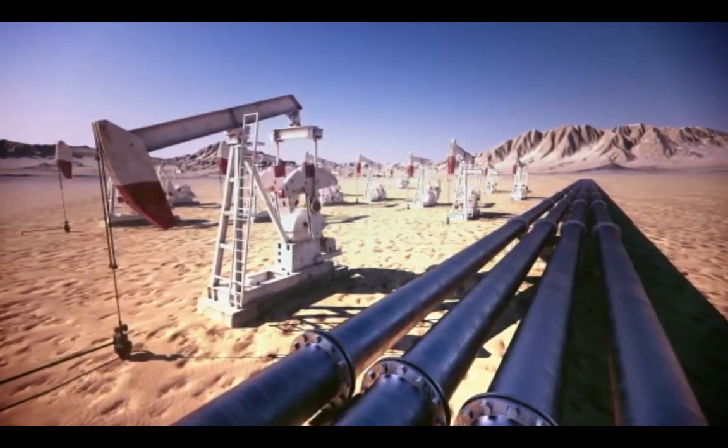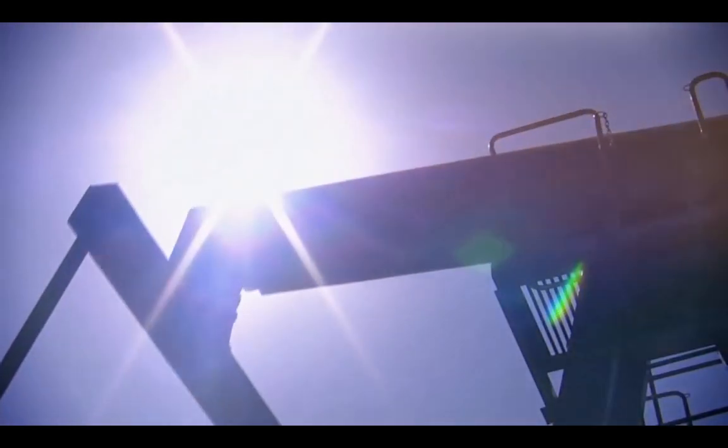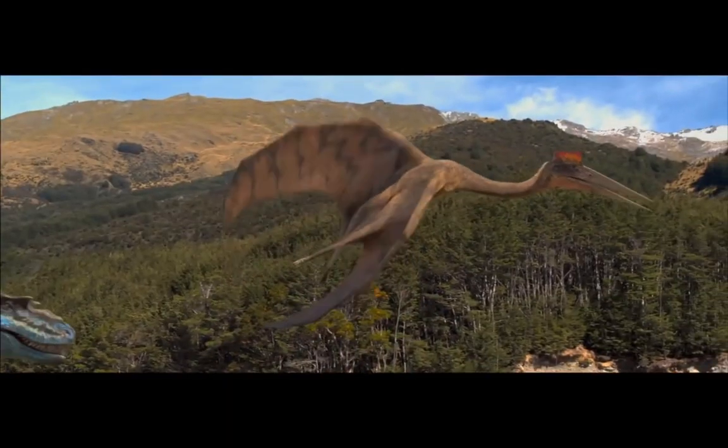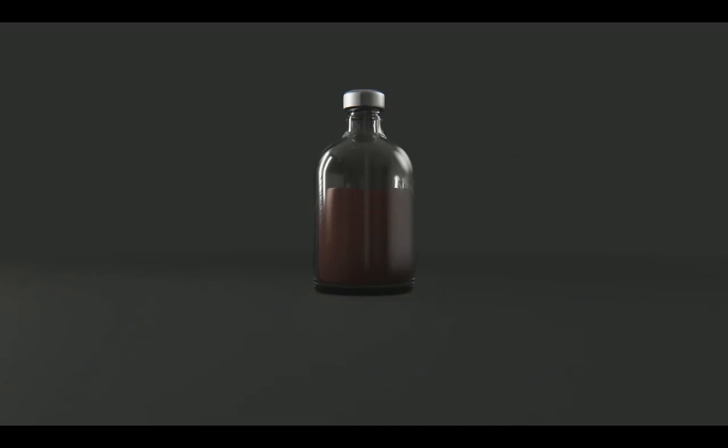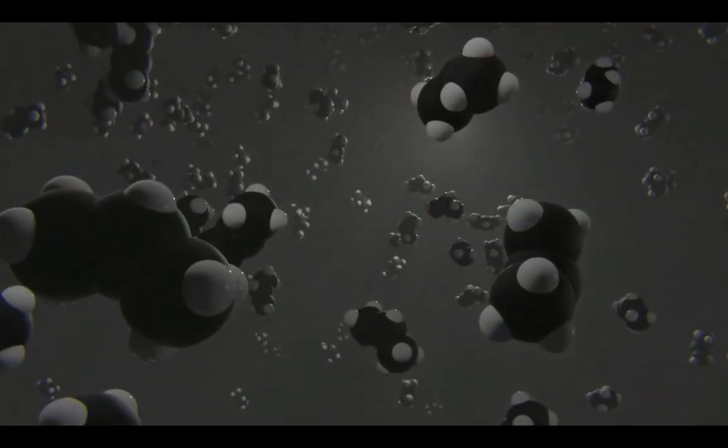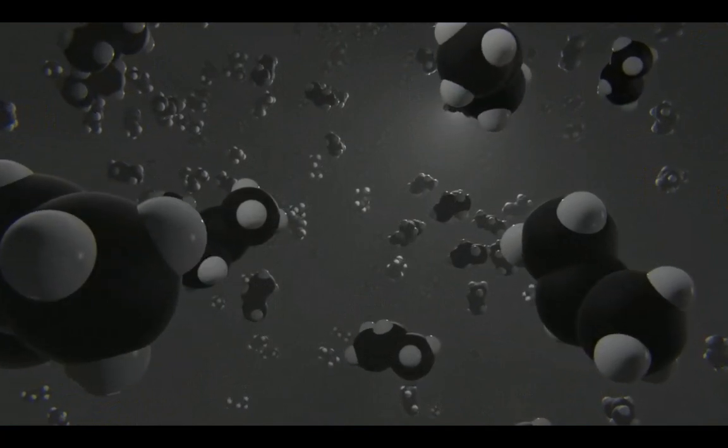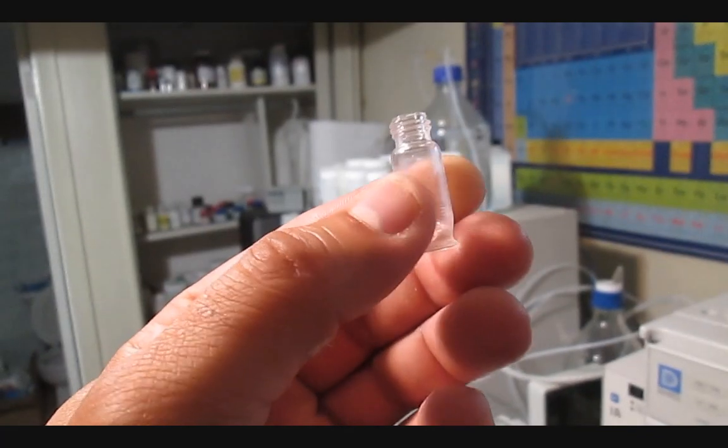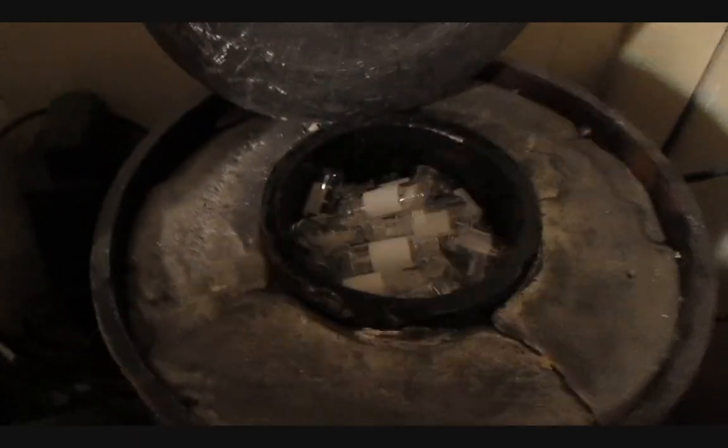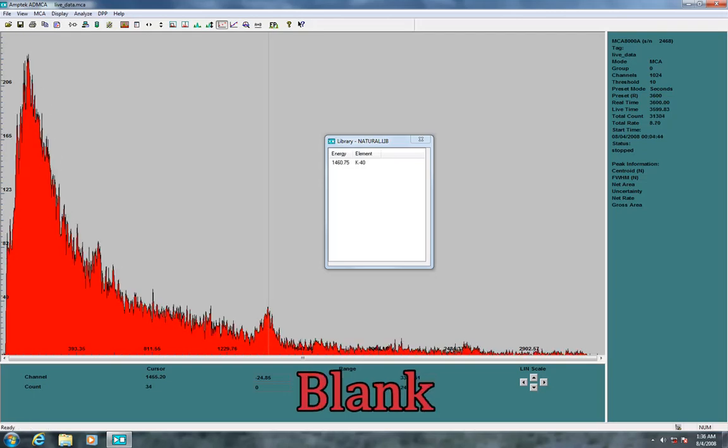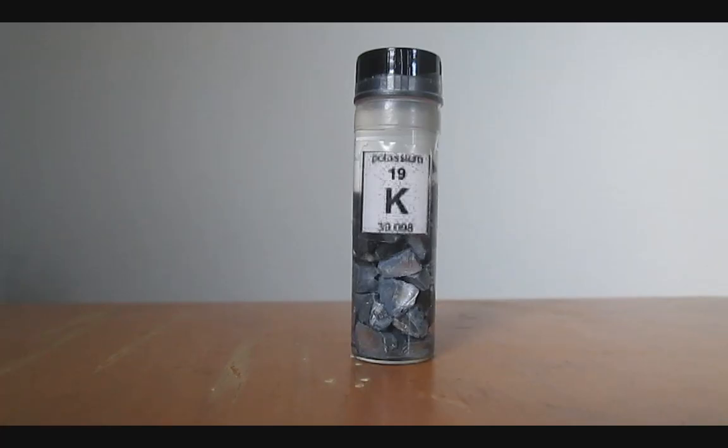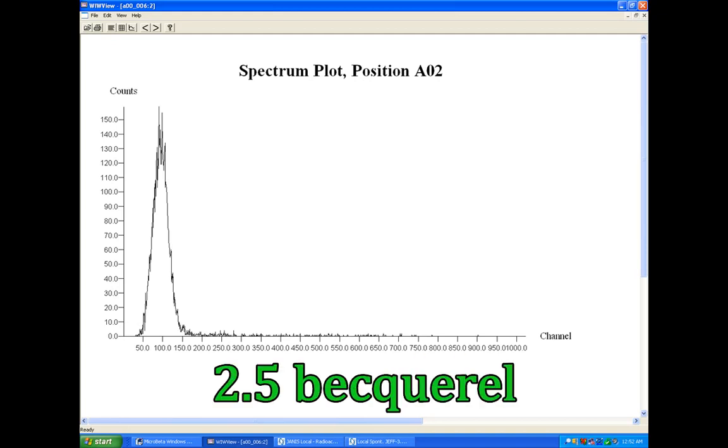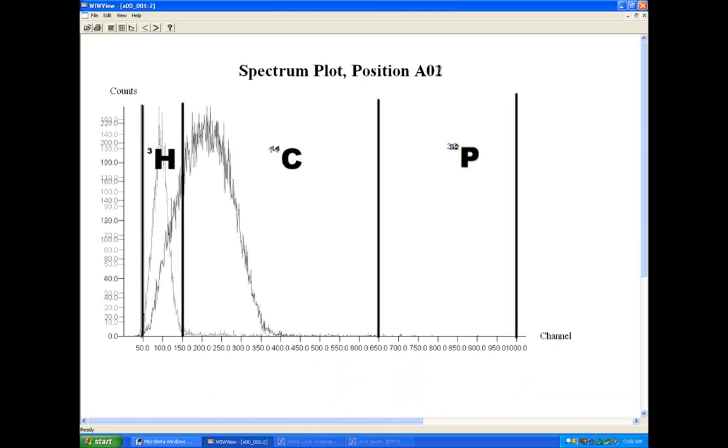As a side note, all of the carbon-containing chemicals used are from the petroleum industry, and petrol oil is a natural product hundreds of millions of years old. The carbon-14 it may have contained has long since decayed, and those chemicals are virtually radiocarbon free. I use these plastic tubes specifically designed for liquid scintillation counting, because some glass molecules contain trace amounts of potassium, and as you know, natural potassium has a beta-emitting radioisotope that interferes with the measurement. Here is a glass vial blank where the potassium beta decay is responsible for almost 200 counts per minute, and this may interfere with my carbon dating process.